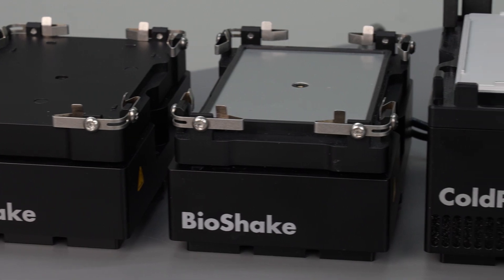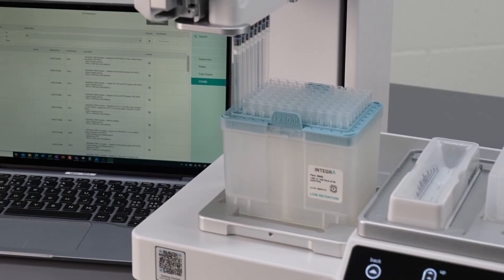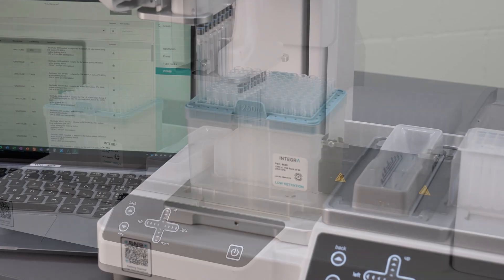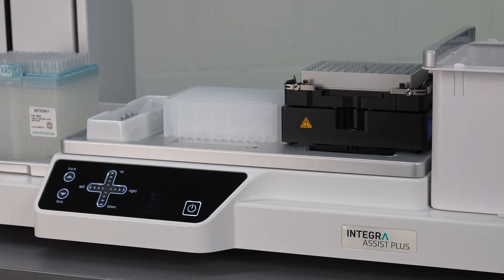These heating, cooling, and shaking modules can be effortlessly integrated into ViaLab pipette software and automated on the ASSIST PLUS. They are compact and robust, and can quickly be placed on or detached from any pipetting workstation.